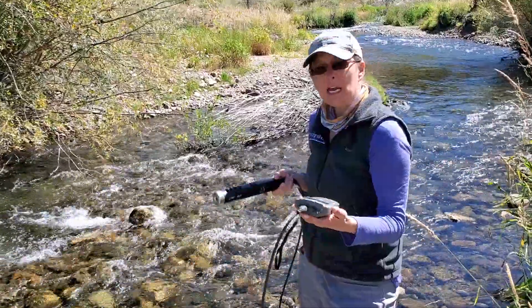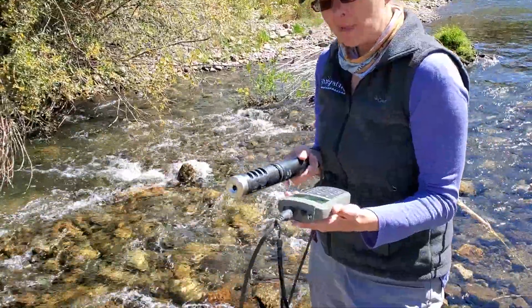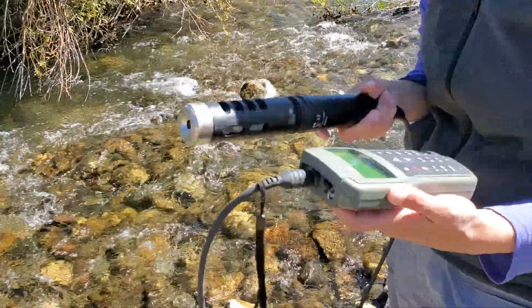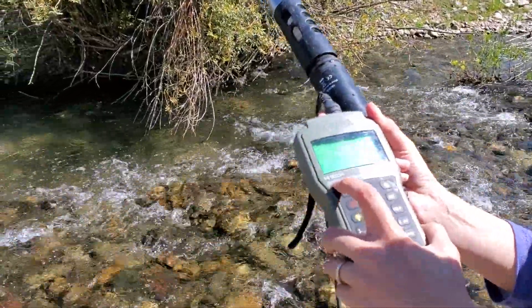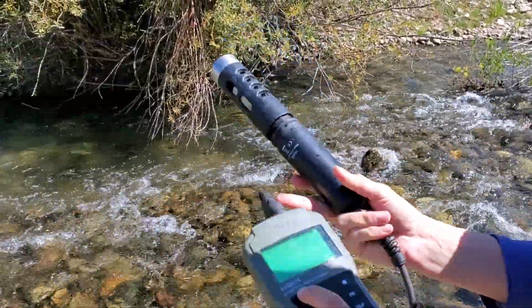I'd like to demonstrate another type of meter. It's more of a scientific grade meter. In this case, this meter is a multi-parameter meter. It can collect pH, electrical conductivity, and dissolved oxygen.